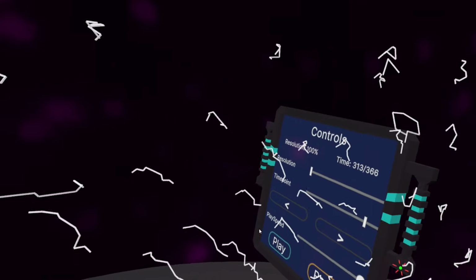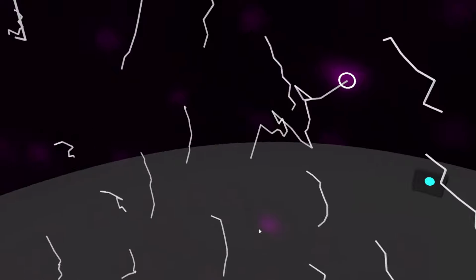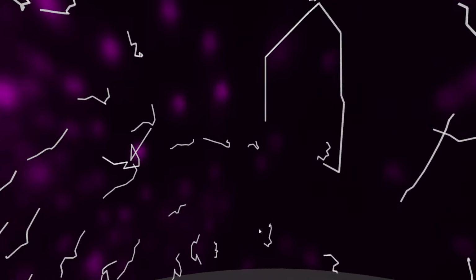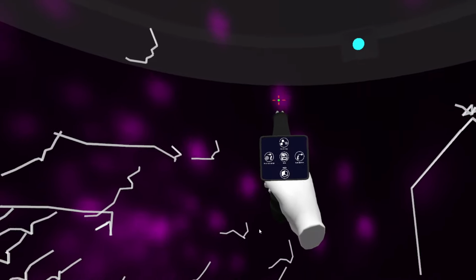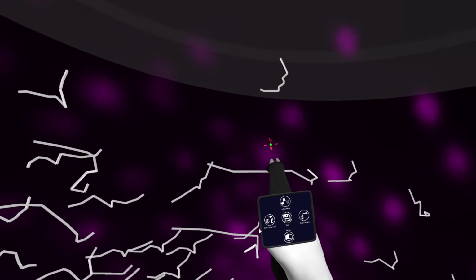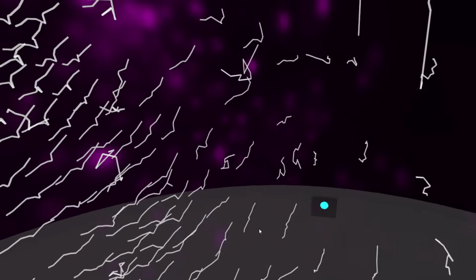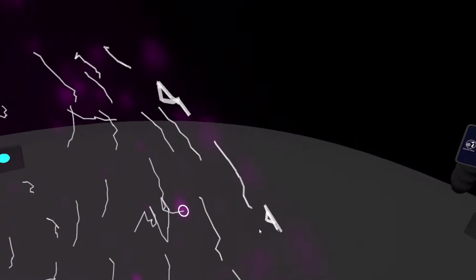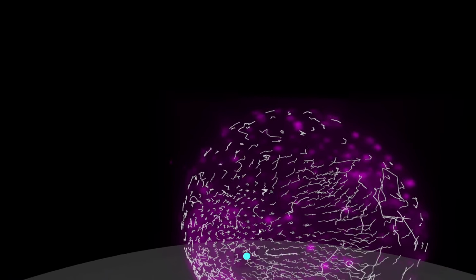All right, and this is basically how you can track in VR. It's much faster, much more efficient, and allows you to follow cells with your eyes and in 3 dimensions in a very accurate manner, because you know where you're touching in a 3D dataset. And this was the presentation of the first sort of alpha of Microscopy VR.